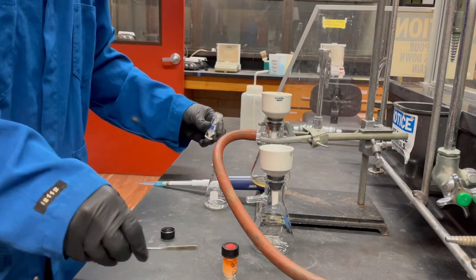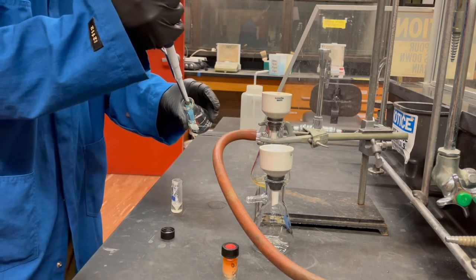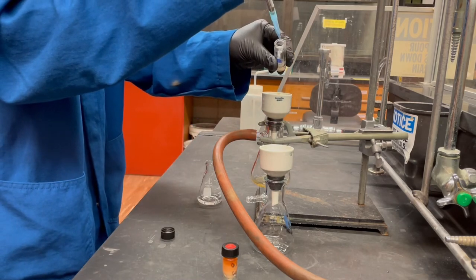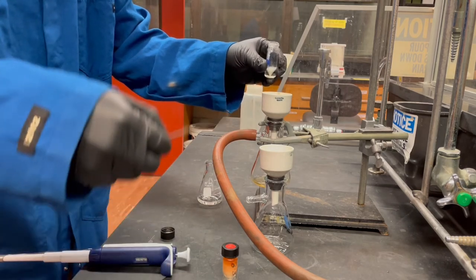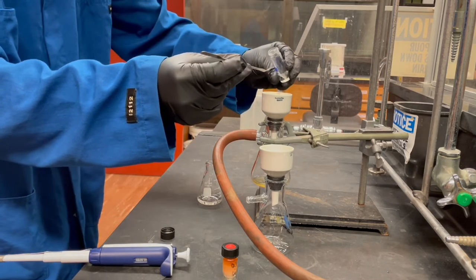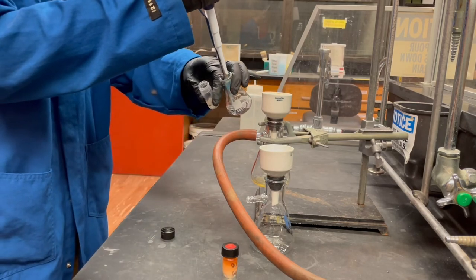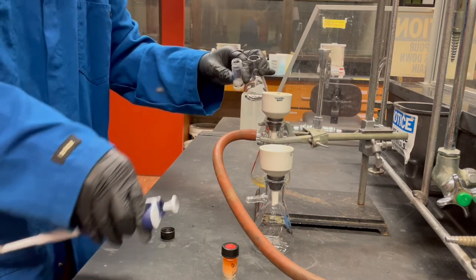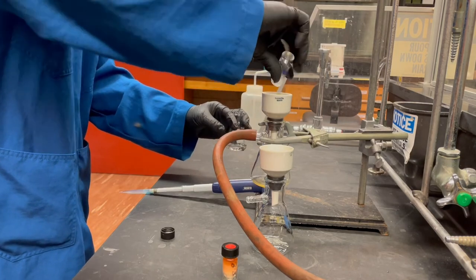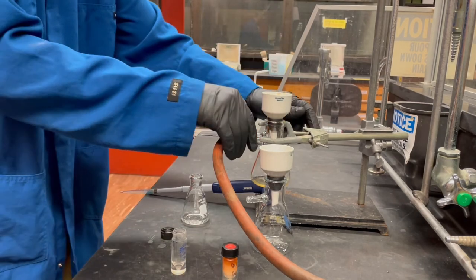So we're adding two 1-milliliter portions of the ethanol to rinse this out. That's why the ethanol had to be cold, because we want to reduce the solubility. Give a little spatula action. Pour that over there. So that was one rinse. Hit it with one more. That's also rinsing the solid material.